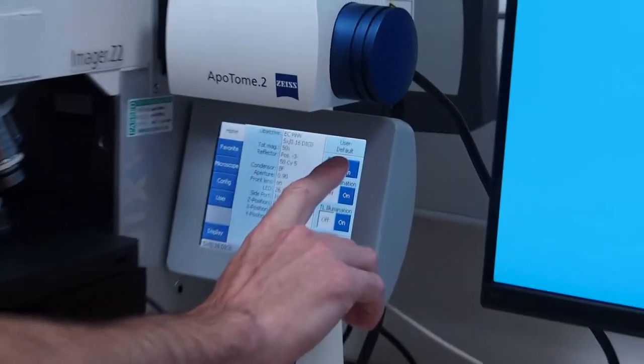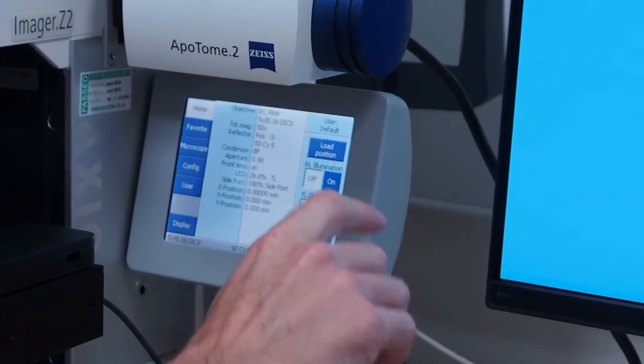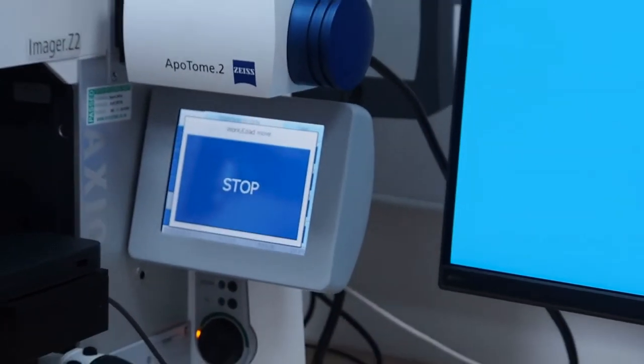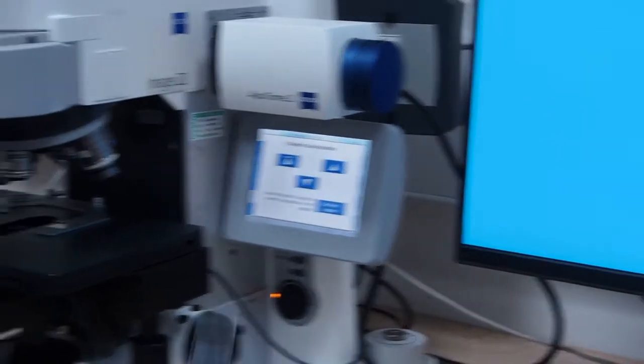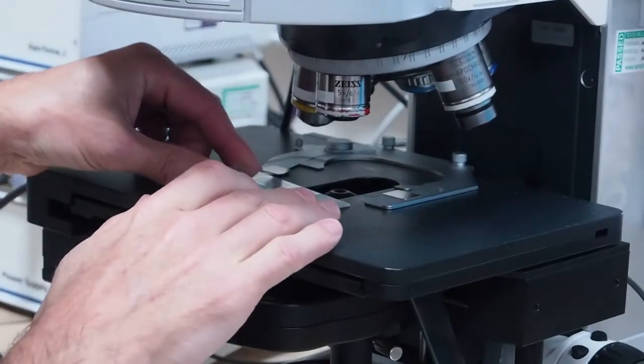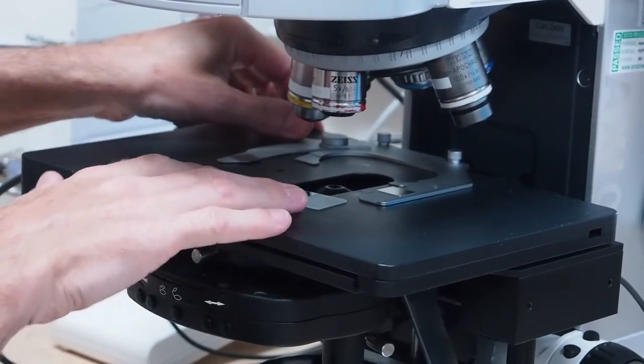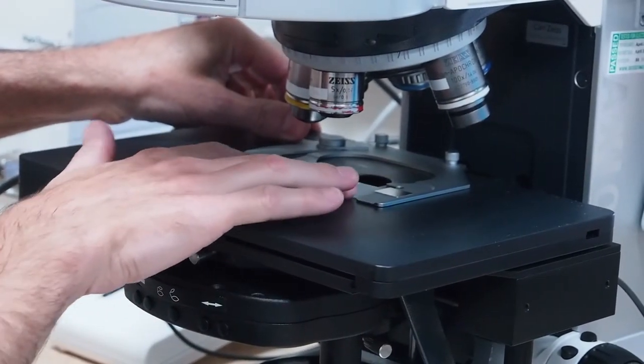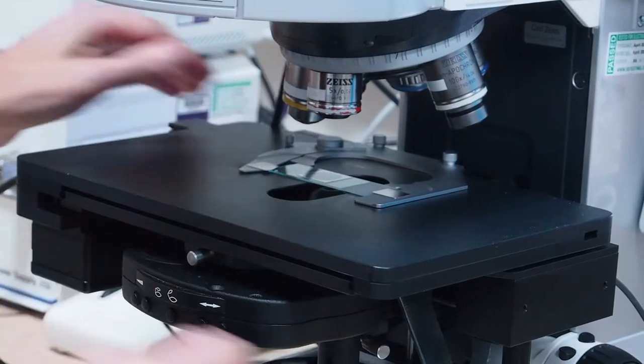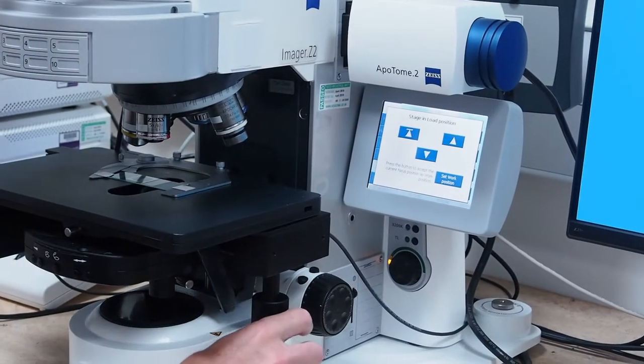To load your sample, use the touchscreen load position button to move the stage down. Carefully add your slide to the stage, ensuring it is coverslip upwards and flat. Then use the stage control knobs on the right to move to the area of your slide containing your sample.